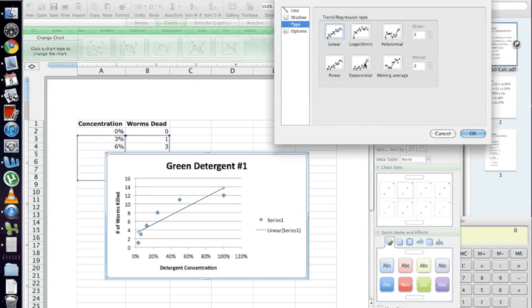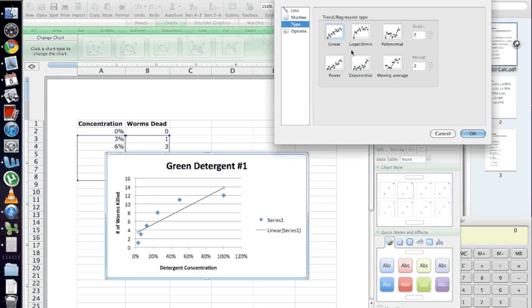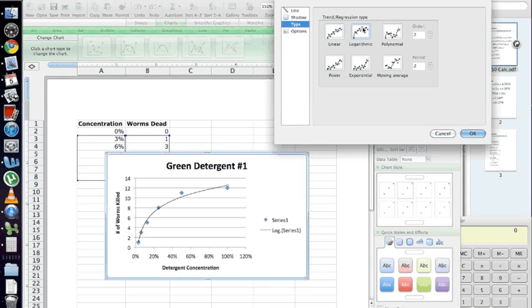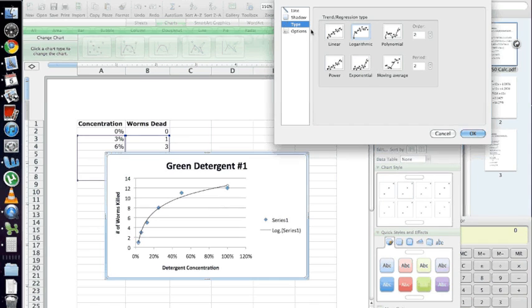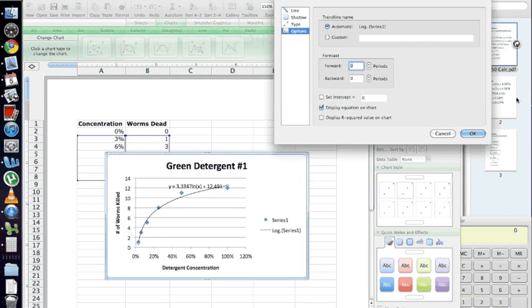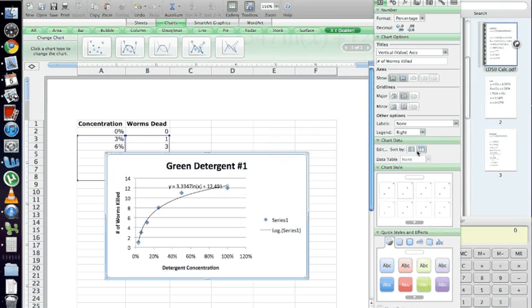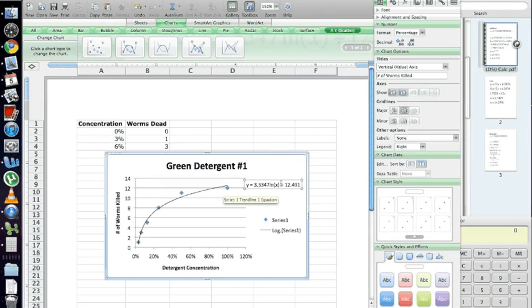Now, which one you choose is going to be completely dependent on your data. In this case, a logarithmic looks best, but whichever line fits your data points the most closely is the one that you want to use. Once you have that in, go to Options, Display Equation on Chart, and you're ready to go with your trend line.